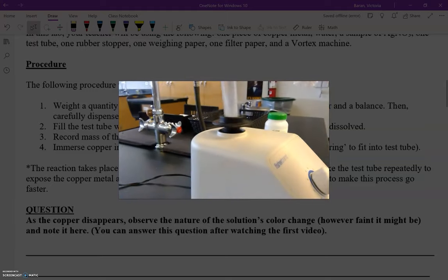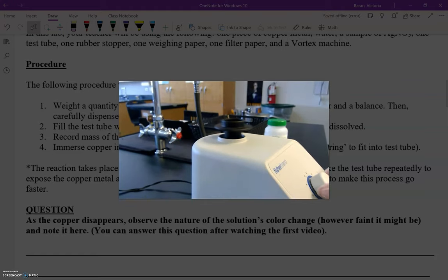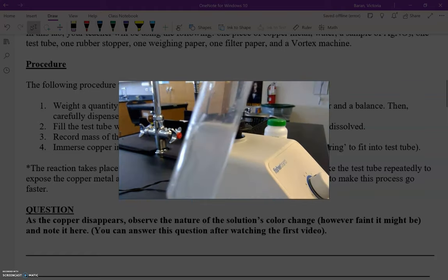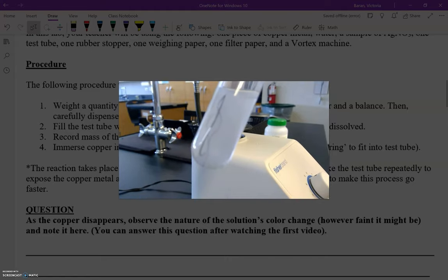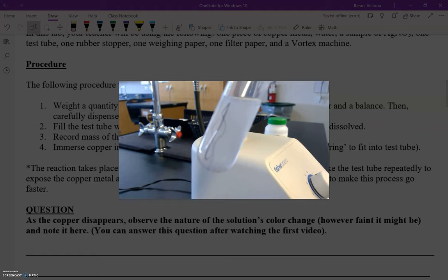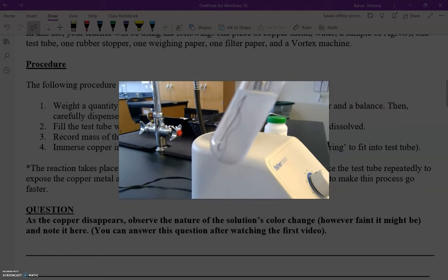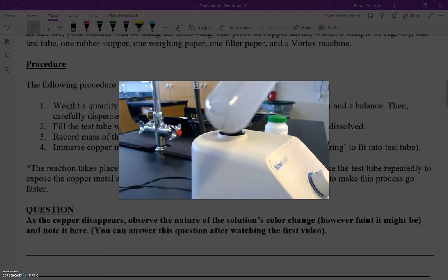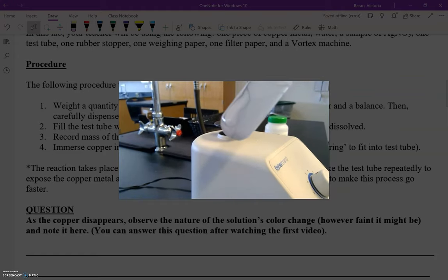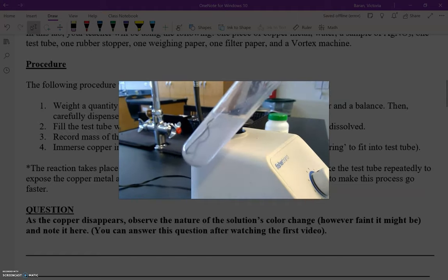I'm using the vortex machine here. Let me turn this off for a second. You know copper is pretty shiny — but the copper is starting to get this dark coating on the surface of it. Normally copper is really shiny, but it's starting to turn almost a black color. You can actually see at the bottom I'm starting to get a little bit of a black or dark precipitate. Use that to help you answer the question. I'm going to keep doing this until the copper is completely gone.